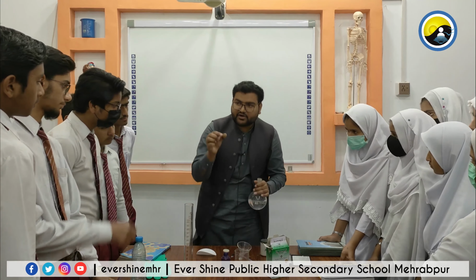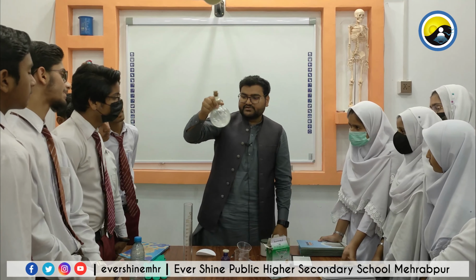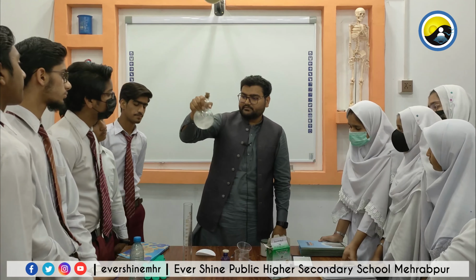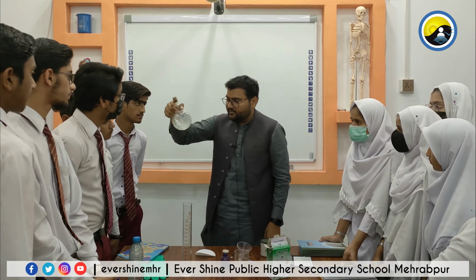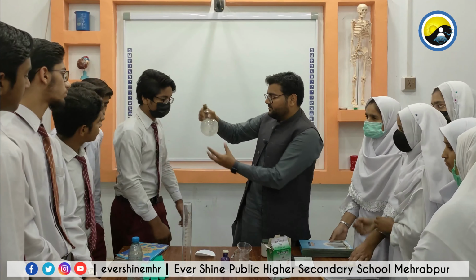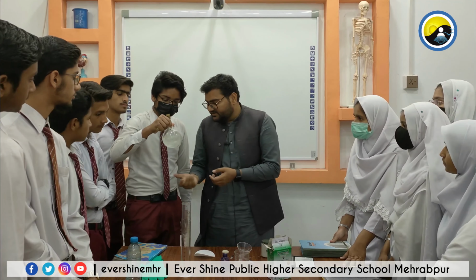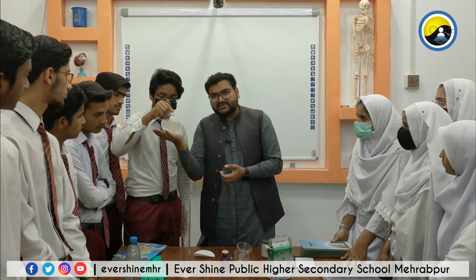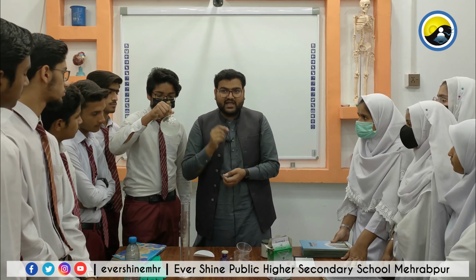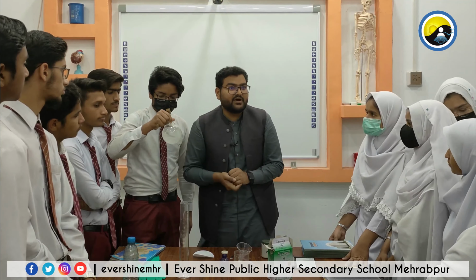Okay, this is the cork and we will cap it, and now we need to shake it to dissolve. Come here and shake it until it is dissolved. While you are dissolving it, you will notice that the bottom of the container becomes hot. It shows that the reaction happening here is exothermic. In an exothermic reaction, the container always heats up.